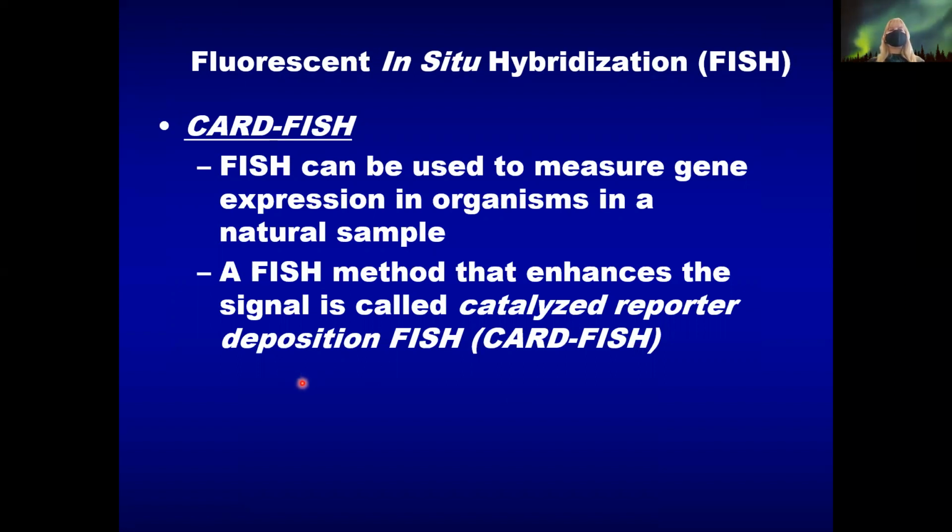It's just kind of a tweak. It improves the FISH procedure, and it really does allow for some nice questions of gene expression. So I want to know not only who's in that habitat, but what are they doing. And so gene expression patterns you'd have to look for.